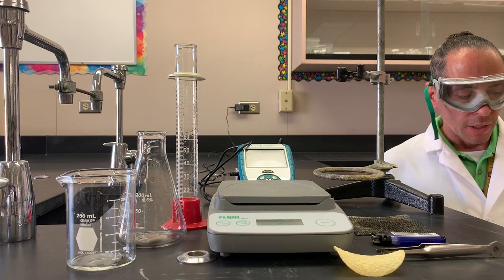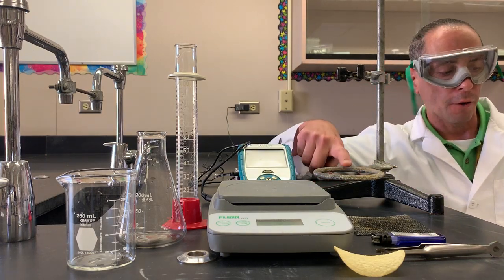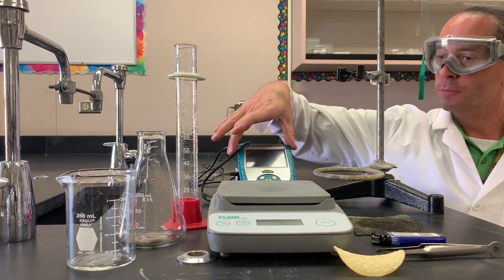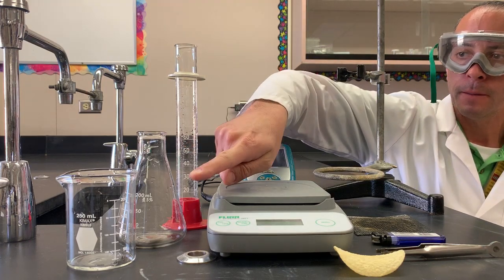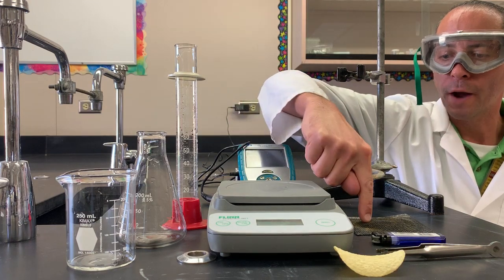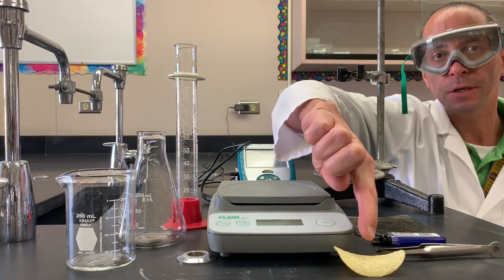The materials we're going to be making use of for the lab include our ring stand, our iron ring, a clamp, a temperature probe, graduated cylinder, flask, beaker, electronic scale, wire mesh, lighter, forceps, and a tasty chip.